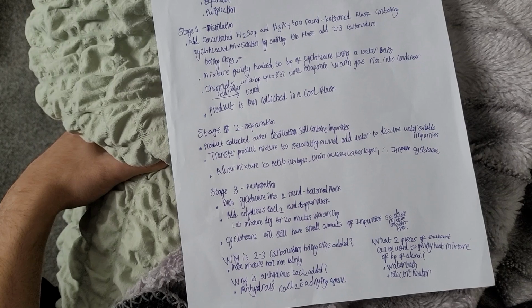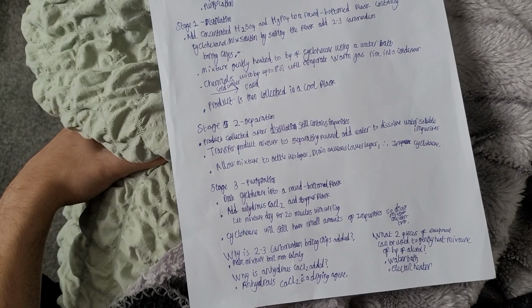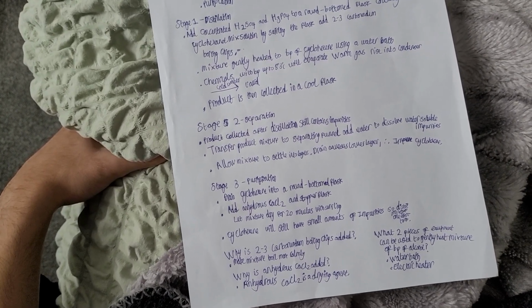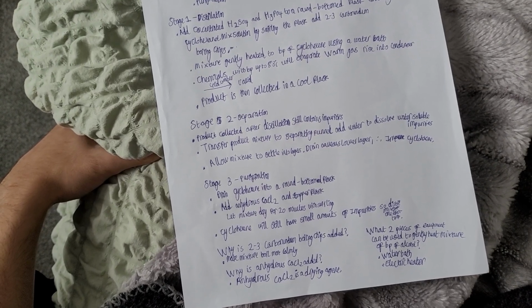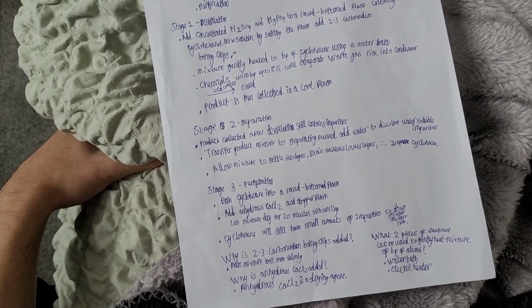Why are 2 to 3 carborundum boiling chips added? To make the mixture boil more calmly. Why is anhydrous calcium chloride added? Anhydrous CaCl2 is a drying agent, therefore it's added. What 2 pieces of equipment can be used to gently heat a mixture to the boiling point of the alcohol? Water bath or an electric heater.